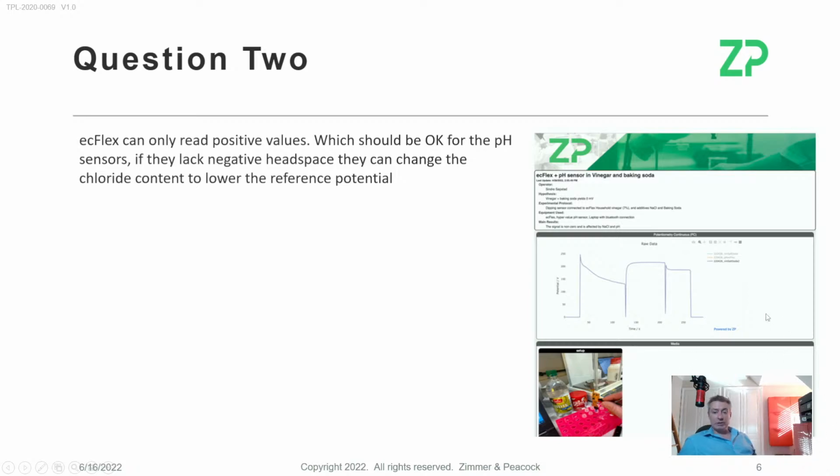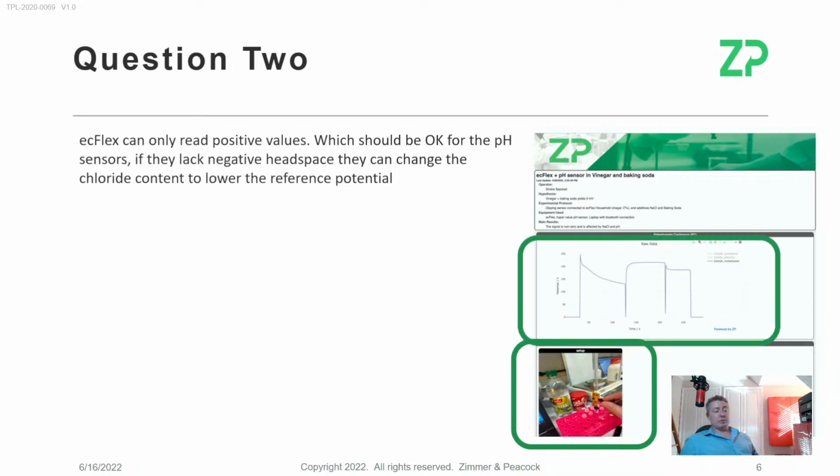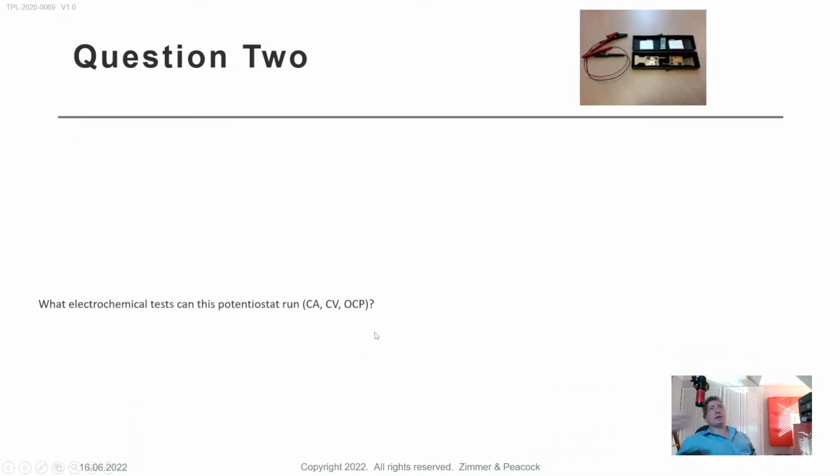This is a snapshot from Julie. Julie is this cloud database. It's free for academic use, and you can store all your data in there and analyze it. So we use it as a sort of electronic lab notebook. It's particularly good at electrochemical data, and we got a little picture in the database where we took a little ecFLEX with a pH sensor on it, and we dipped it into vinegar, and we dipped it into sodium bicarbonate, and the results were in the positive voltage region, which was what we were expecting, and they were changing whether we went from bicarbonate to vinegar and vinegar to bicarbonate. So we were essentially happy with the results.